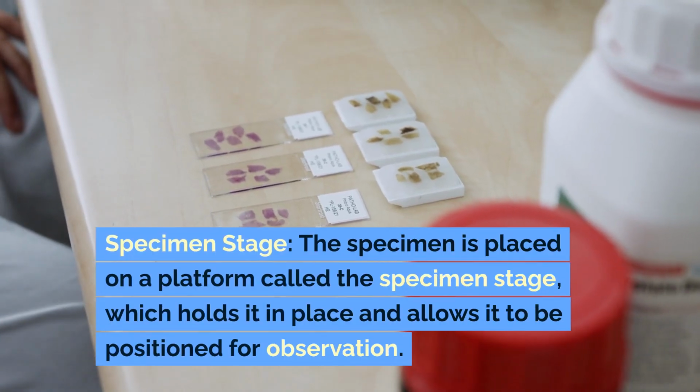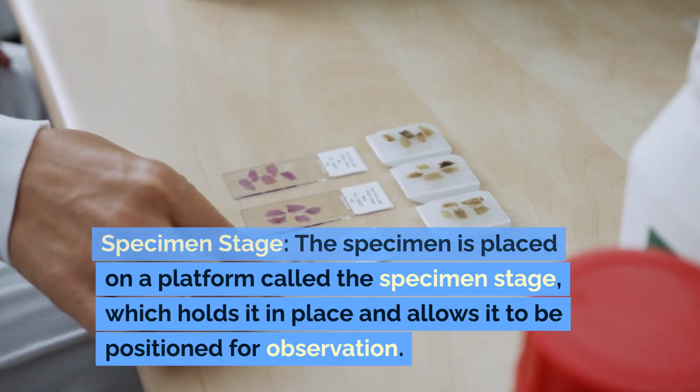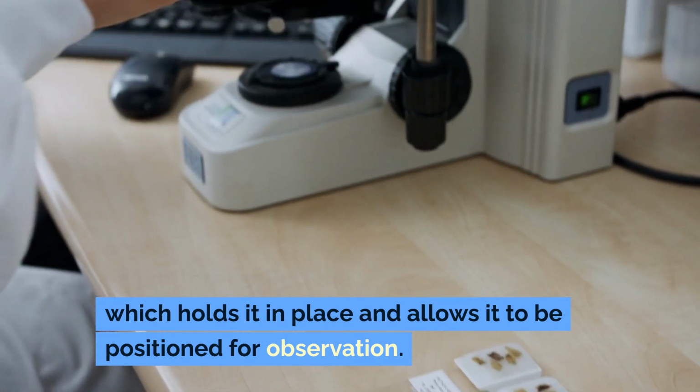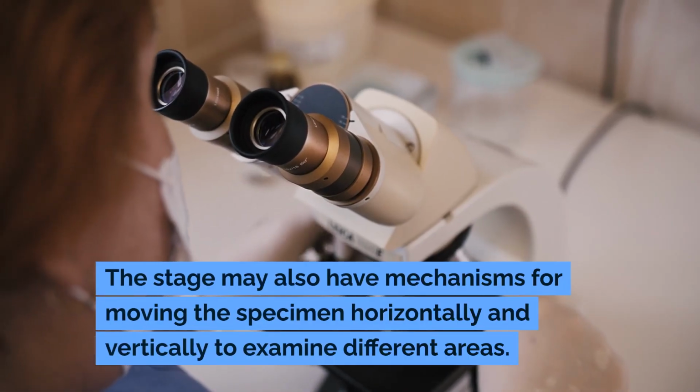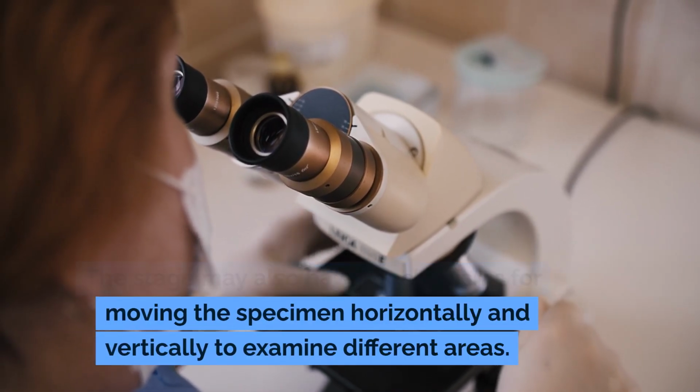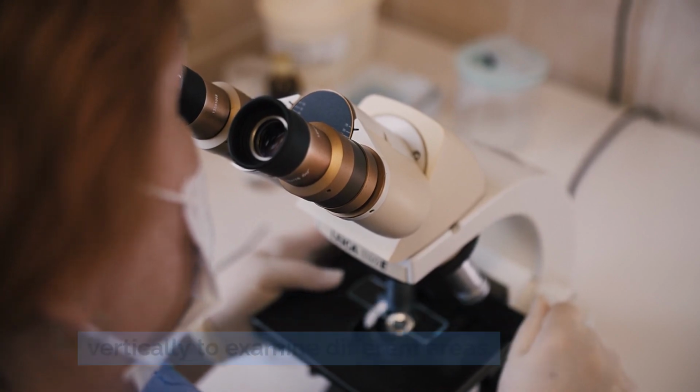Specimen stage. The specimen is placed on a platform called the specimen stage, which holds it in place and allows it to be positioned for observation. The stage may also have mechanisms for moving the specimen horizontally and vertically to examine different areas.